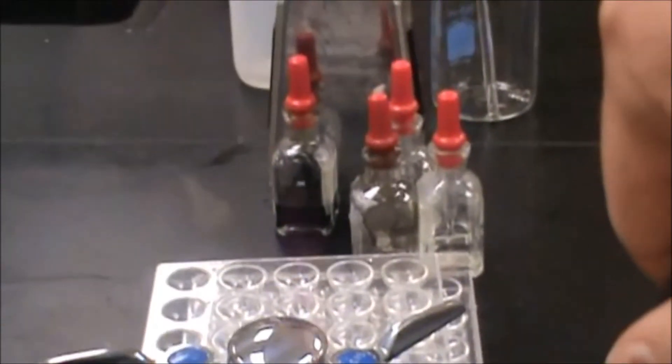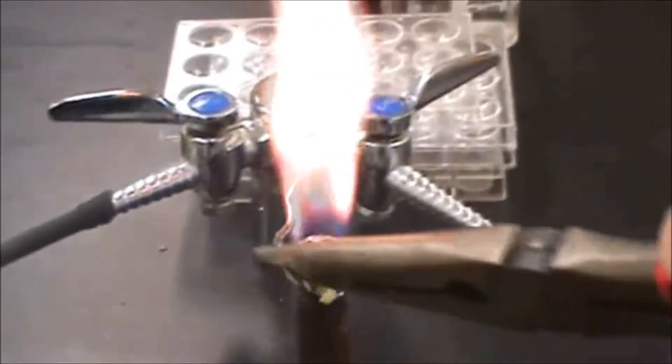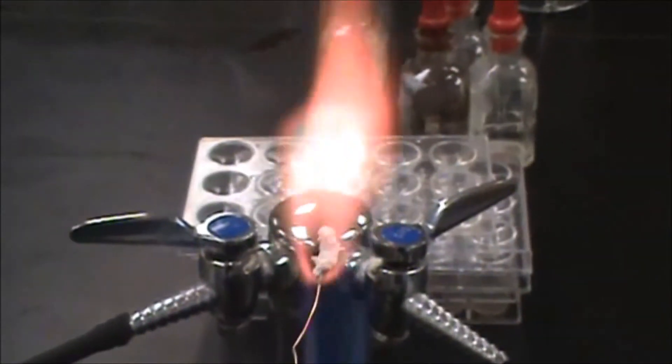Then we're going to take that paper clip and put it into the flame to warm it up a little bit. Then we're going to dip that into the sodium borate, pick up some sodium borate, put that back into the flame. You're going to see a lot of orange color from the sodium.